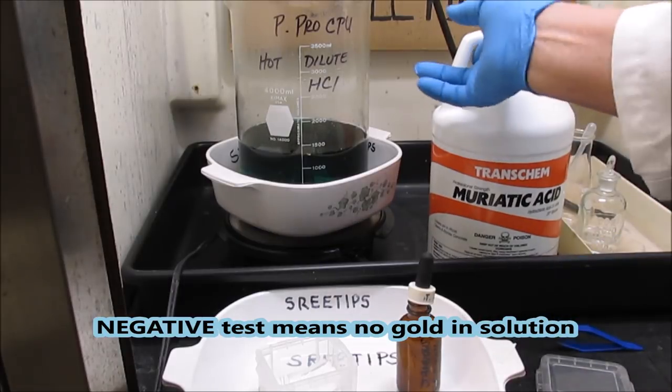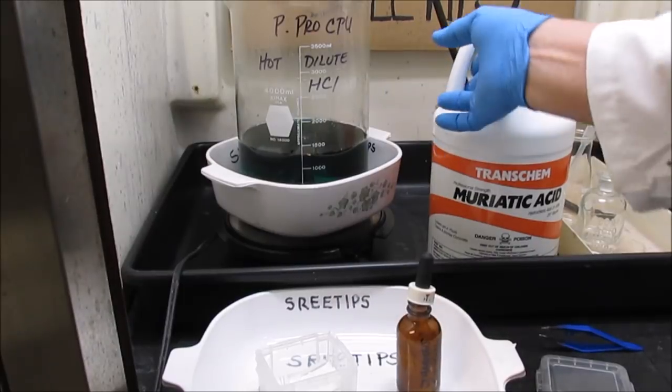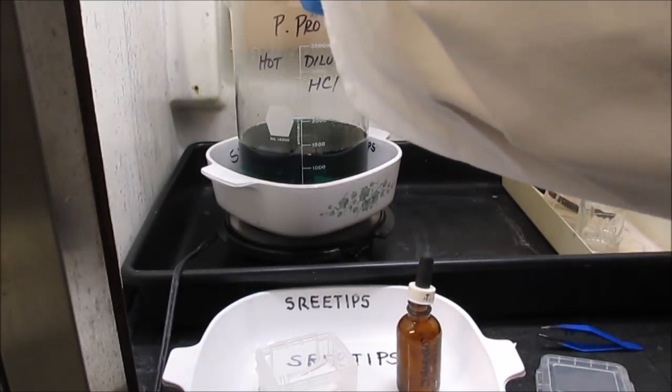Now I'm going to go ahead and add, it's down below 1500. I'm going to get it back up to 1500 with some more concentrated hydrochloric acid here.